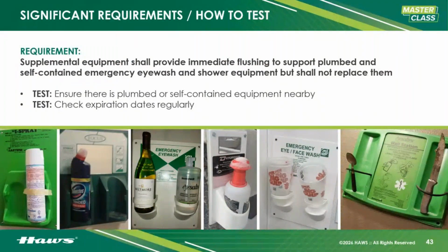But in all seriousness, you need to make sure you're not replacing these with anything weird. The middle one's frozen. That was on the back of a truck, completely frozen. You got the double big gulp option. Not great. And then it's come too far, like eyewash solution ain't gonna cut it. You got the spoon and somebody's leftover lunch on the knife. But these are only intended to supplement equipment.